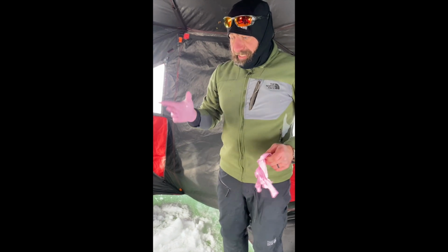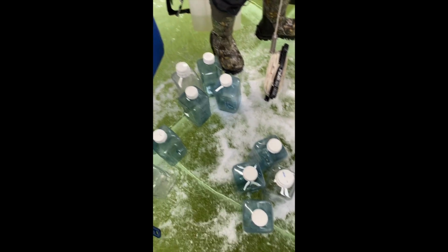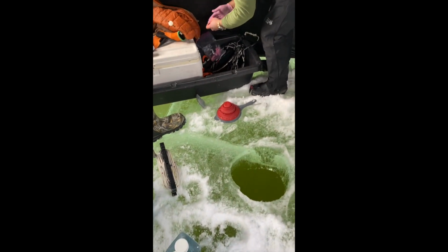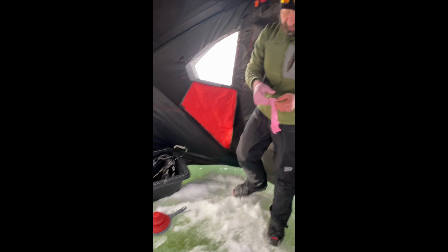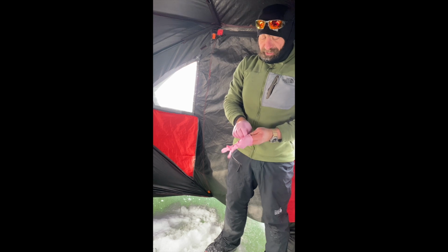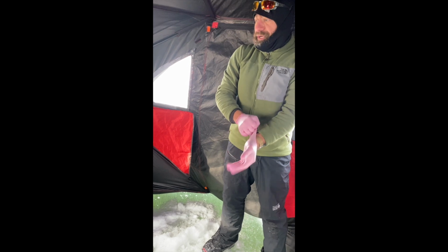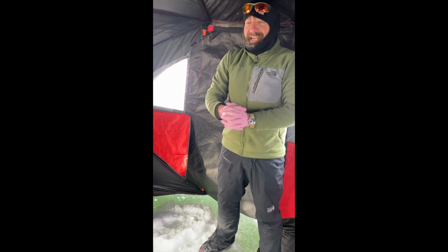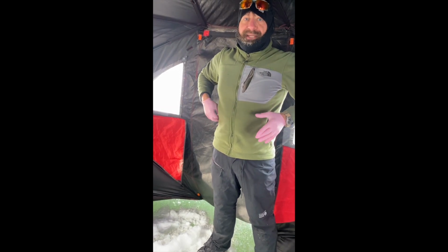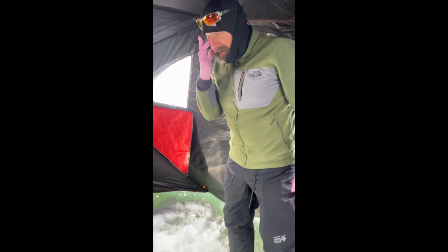Okay, so we're ready to get our water sample. We're collecting 8 liters from each depth, and we're collecting from 3 different depths: right under the ice, the water column mid depth, which is 4.5 meters for us here, and 1 meter above the lake bottom, so about 8.2 meters for us. It's important not to hit the bottom with the Van Dorn because unlike in the summer, moving to a different undisturbed spot is kind of a pain, and the water column will take a while to settle if you disturb it, so we try to be quite careful.